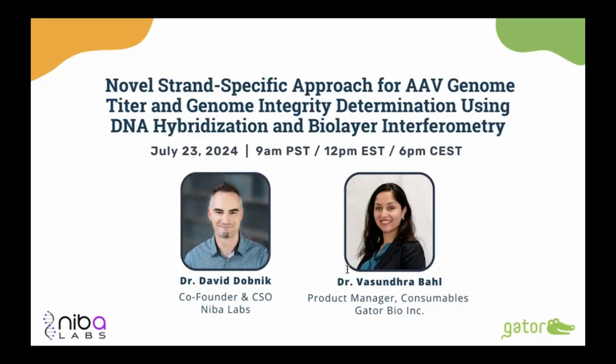However, with the BLI system, this should, let's say, at least in theory, work. I must admit that we did not try it yet, but since it is a strand-specific technique, you have different oligo targets in both of the strands, although they are complementary. So in theory, I would say that it could be used also for that, and perhaps one of the only technologies that can give you some kind of quantitative evaluation of those self-complementary vectors.